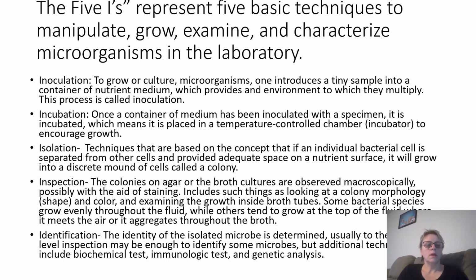First step is inoculation. To grow or culture microorganisms, one introduces a tiny sample into a container of nutrient medium, which provides an environment in which they multiply. This process is called inoculation.